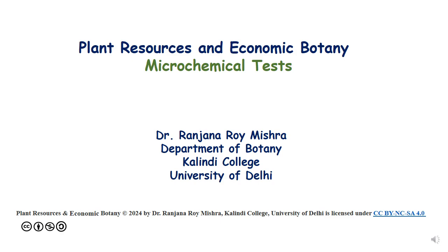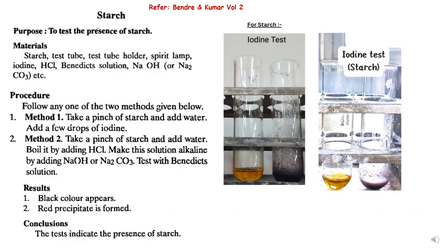Hello, dear students. In this lecture, we will discuss microchemical tests done in the economic botany laboratory. So, the first test which we are going to discuss is the starch test. To test the presence of starch, we require a test solution. Then we require test tubes, holder, spirit lamp, iodine, hydrochloric acid, Benedict solution, NaOH, etc.